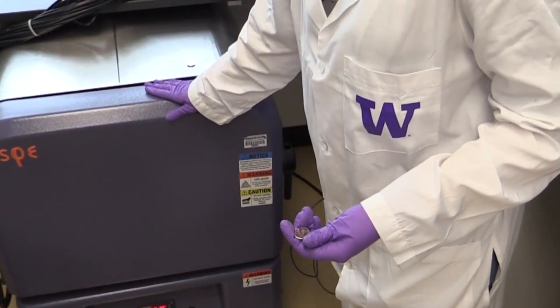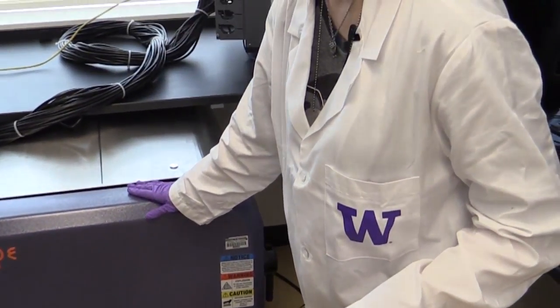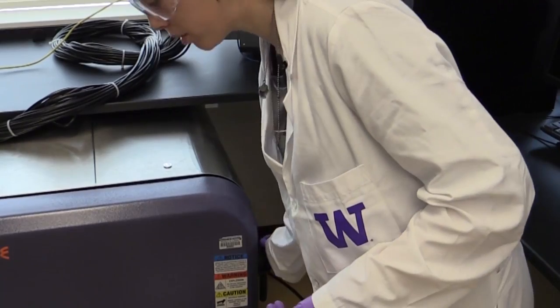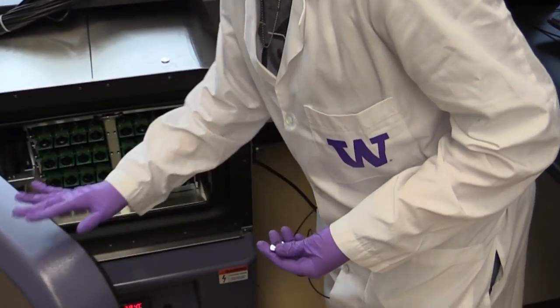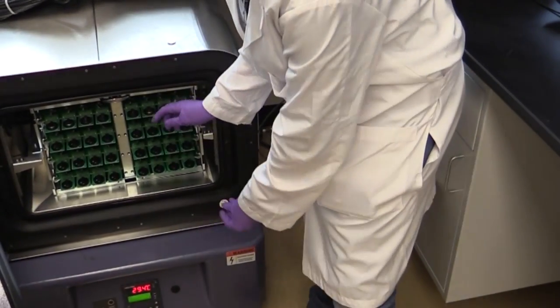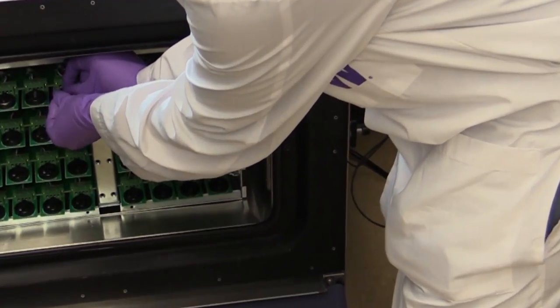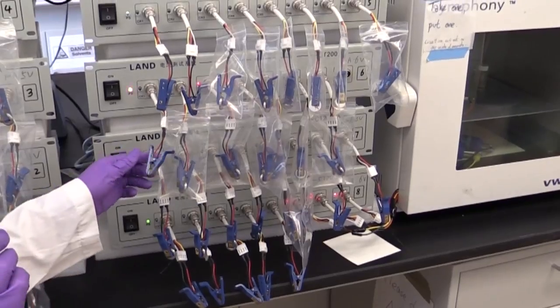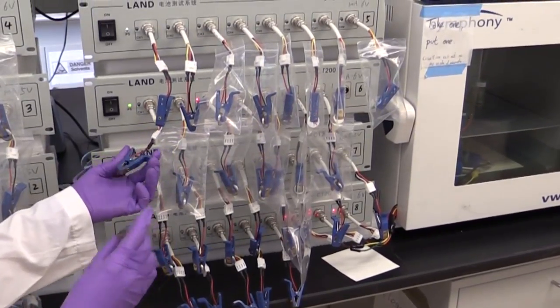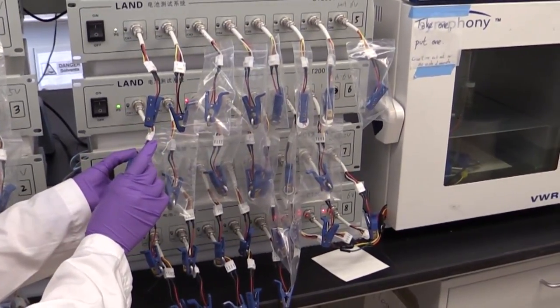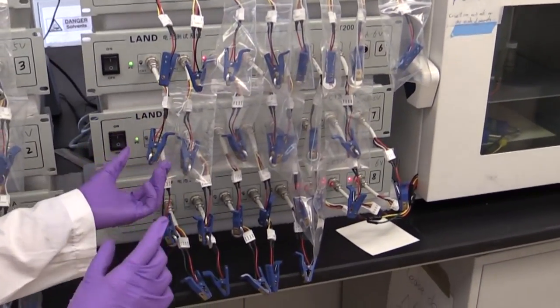This is a battery testing system from Arbin. It's temperature controlled, so you can see by the chamber. And once you open it, make sure you select a channel, put your coin cell in, large side facing up, and then you're ready to set the software to run the test. This is the Landt battery testing system. And this one does not have temperature control, so it would be just room temperature testing.